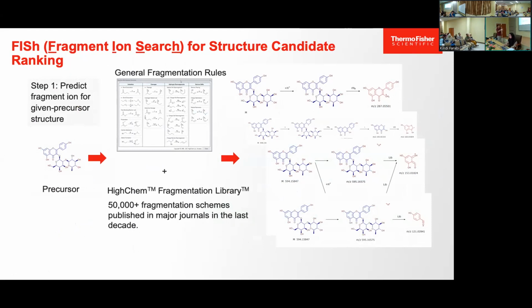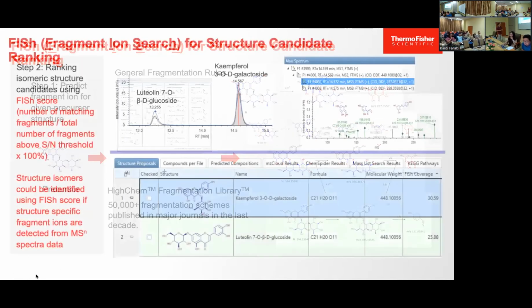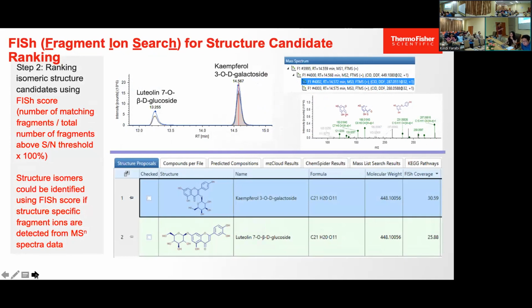Last time I liked this software very much because it always helped me to explain how from 630 it will fragment to become 581. It will give you the pathway of how to fragment. Then it is able to annotate the substructure.